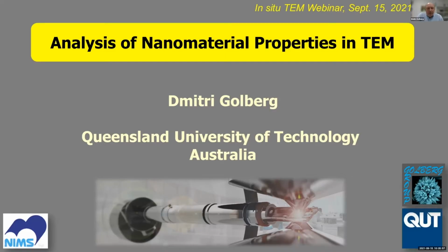So over the next 35 minutes or so, I'm going to introduce to you all types of experiments one can perform inside the electron microscopy column. And consecutively, I go from one method to another. I spend just maybe 5 to 7 minutes on each technique. Of course, we have done much wider and richer experiments in Japan and now in Australia. But because of time limitations, I will just touch the basics of this research.